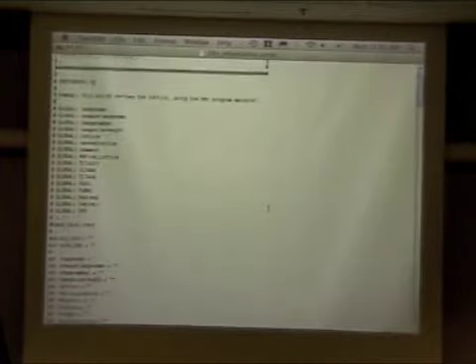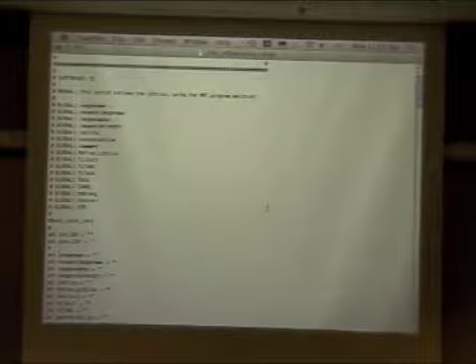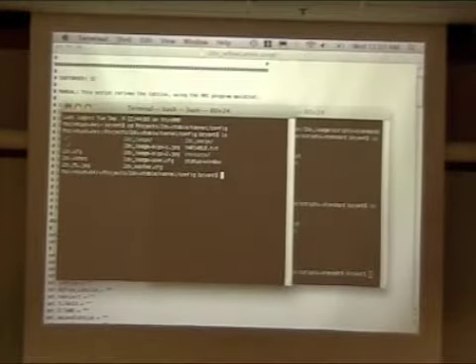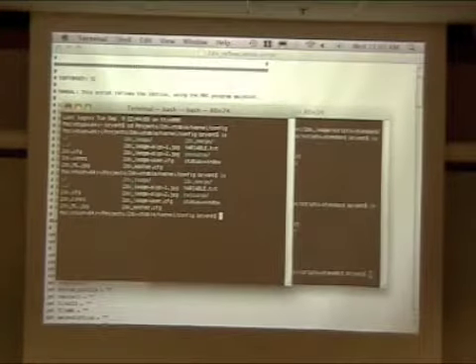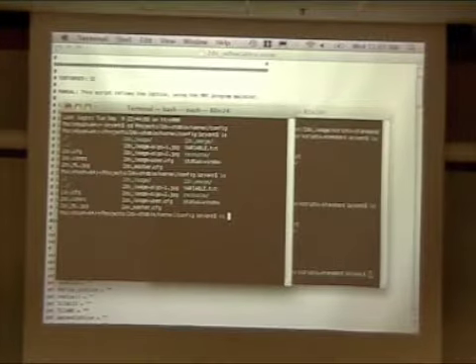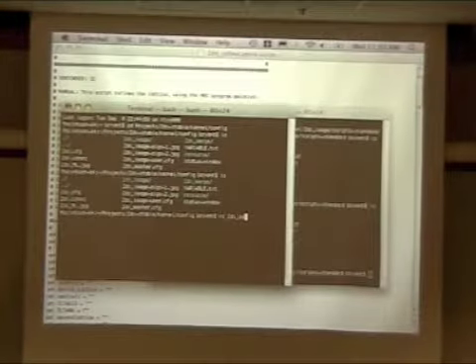Okay, the next thing are these little global variables, and all of these represent parameters that are drawn from a common database, and this is defined, again, in this kernel directory in your local 2DX install, and in there's a config directory full of all kinds of interesting things which control the behavior of 2DX. The most important one here being the 2DX master.cfg.